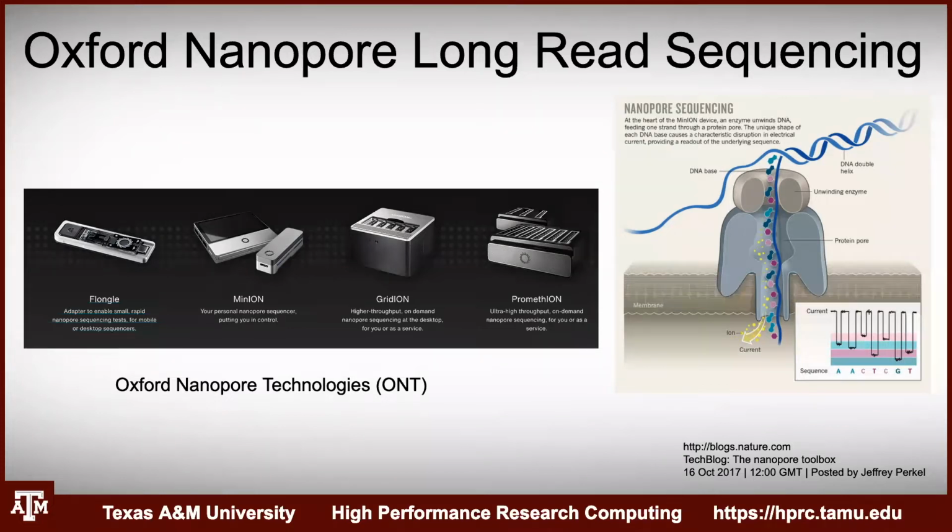Another really cool thing about nanopore sequencing is that the data is generated as you're sequencing. So you don't need to go in and process the run to generate the FASTQ files. Those are being generated automatically. I think with Nanopore, every 10,000 or so reads that it gets, it writes those to a FASTQ file and keeps on sequencing. These runs, I think it depends on the machine, are typically run for about a day, but you're able to pull off data within a couple hours. You can start getting your data and looking at it.